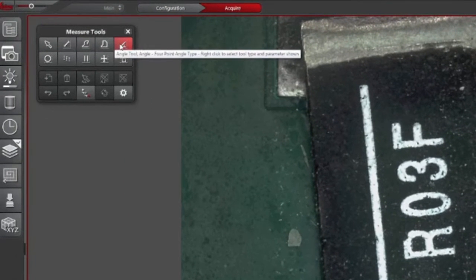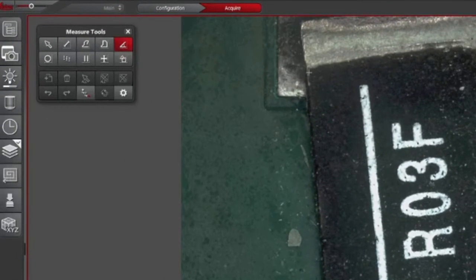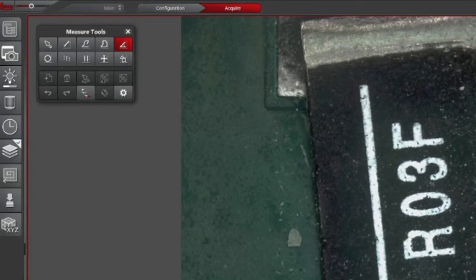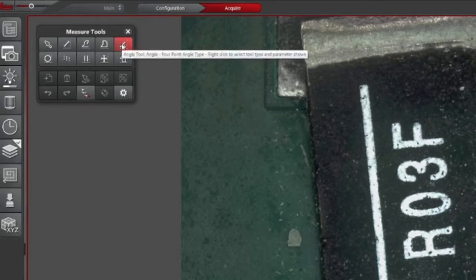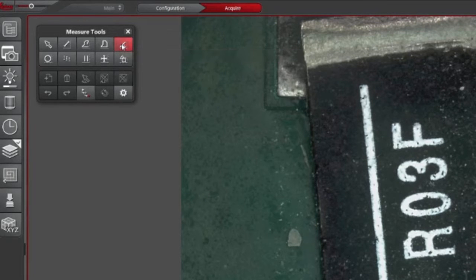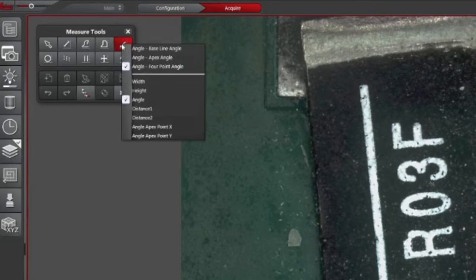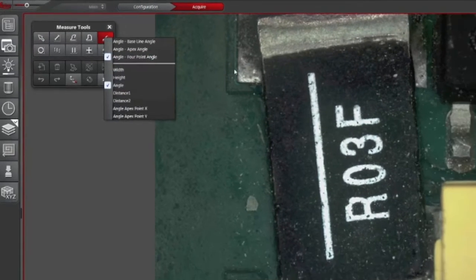We want to measure the angle of that black resistor against its soldering points, so if you click on the angle tool with the right mouse button, we choose the four-point angle and we want to know the angle.